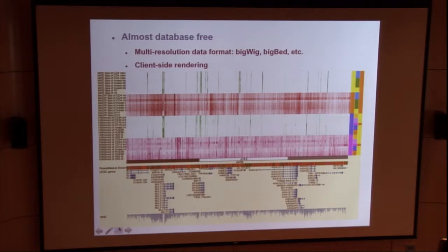So this is a colorful way of encoding the information of your data, your sample, the age, gender, response to chemo, whatever you have as metadata for the data. When your data is in the hundreds and thousands, you need that metadata to help you organize your genomic data. So that's probably one of the earlier innovations for this line of work.